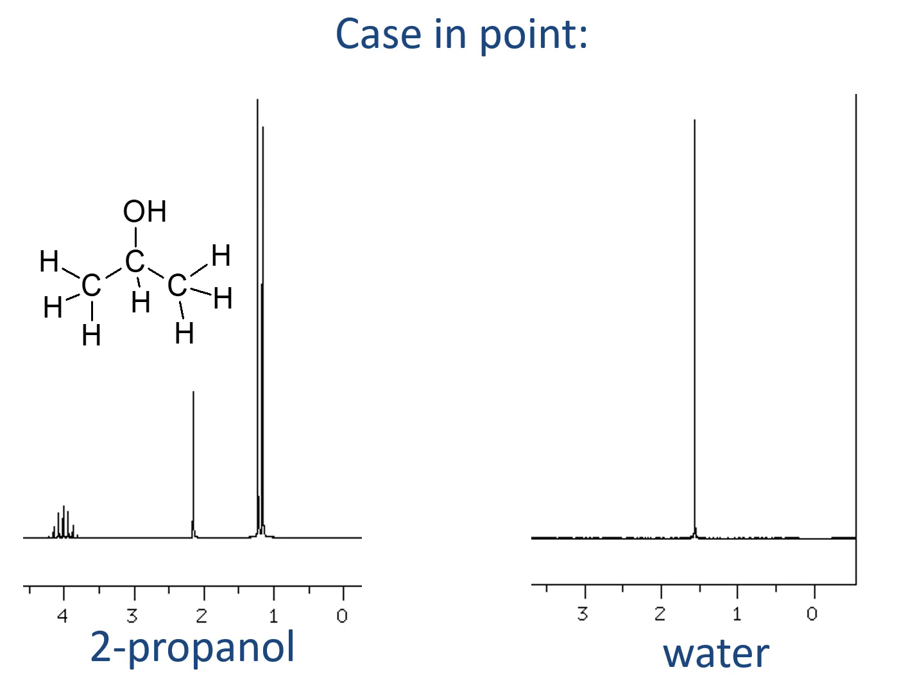And so we can see that we have a number of heterotopic protons here and here and here. So we have 4 different signals that we should, or sorry, 3 different signals that we should see. And we should be able to expect how shifted those are, like we had talked about in the slide before. And we should also be able to tell the splitting. So see if you can identify what the splitting is on the green atom, or what the splitting is on the yellow, and use that to identify which peaks are indicated on the spectrum.